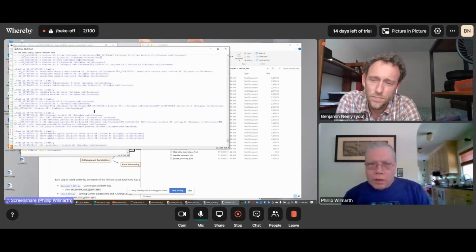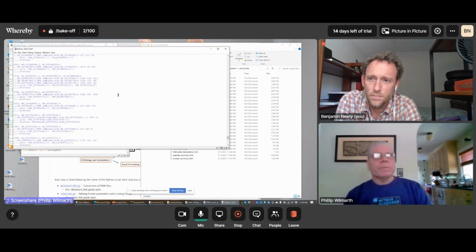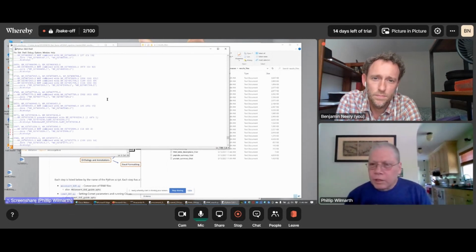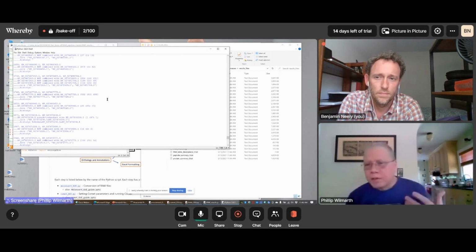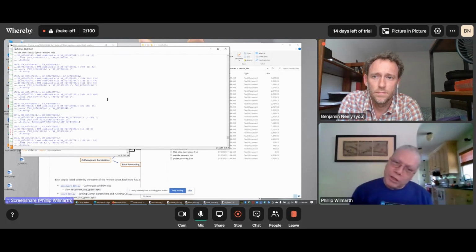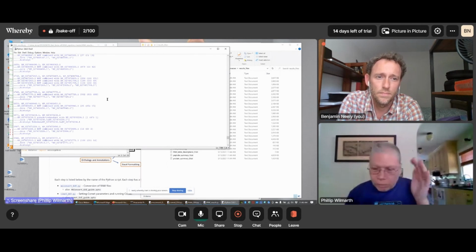So one of the things that happens if your protein database isn't pre-processed, like these canonical protein FASTA files that you can get from UniProt, where basically each gene is represented by one protein sequence, but we know that there's alternative splicing and other things, and you can get multiple proteins associated with one gene. So you can get databases that are one gene, one protein, or databases that have multiple proteins per gene. And in the bigger protein databases with these multiple entries, we often don't see, in shotgun experiments, those peptides that distinguish the different isoforms of the protein. So even though the protein database is large and increases our search times, a lot of times we end up not having enough information there.